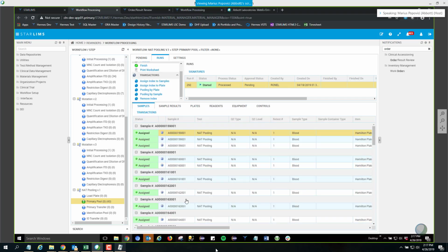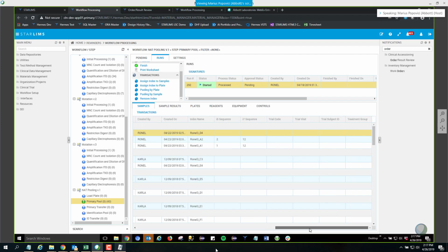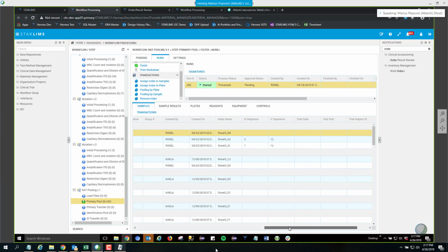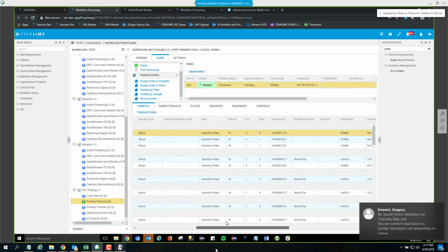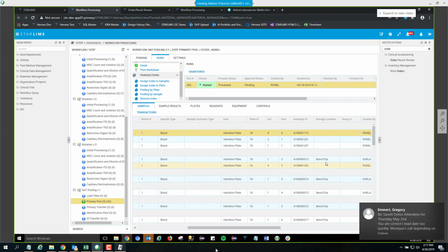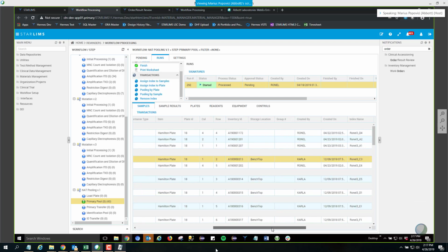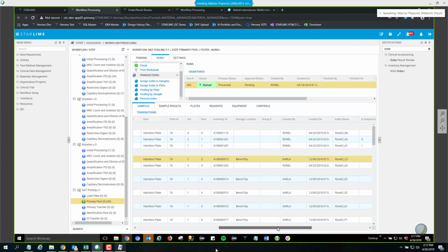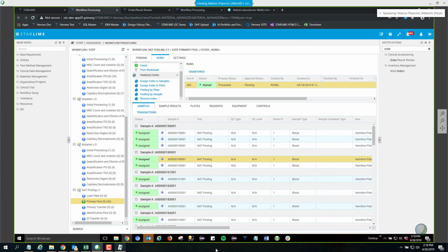The other thing I wanted to show is the additional fields we added to the sample tab. We added all the trial specific fields: code, visit, subject ID, and treatment group, and a few other things that we added yesterday because we thought it was useful. Let's see, the storage location. When we have a storage location, we display it here, so it makes it easier to know where to look for those things, if they're stored anyway. Those are the additional columns that we added.